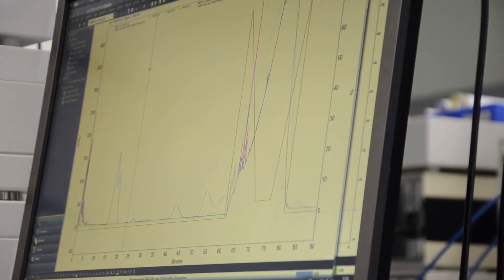This setup is mainly for purification tasks, so you are able to interact manually during the run, for example, or to make shorter runs in milliliters or column volumes.